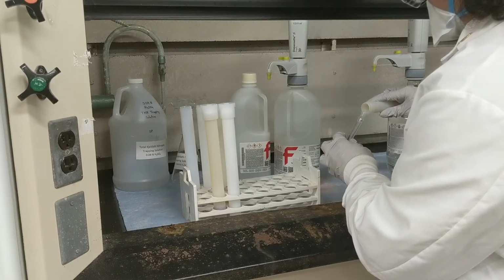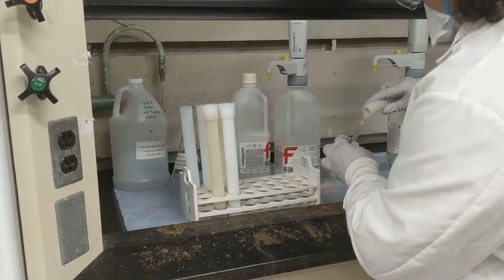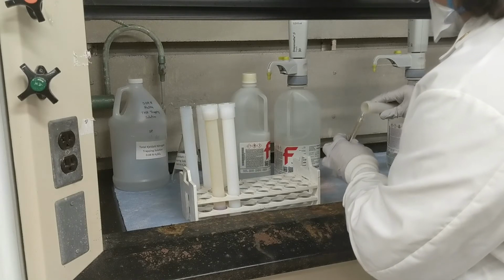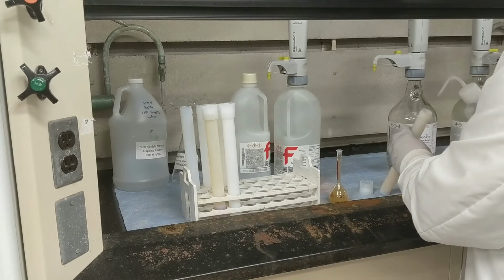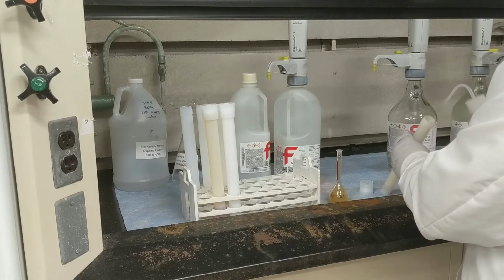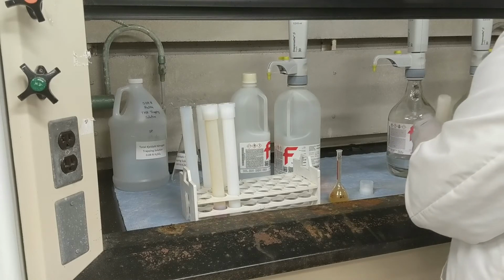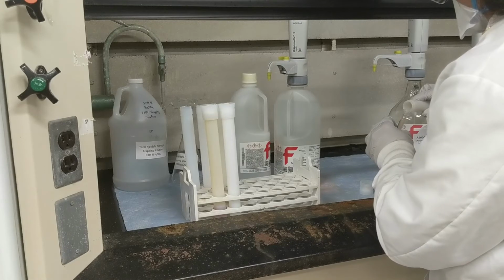For a 50 mil volumetric flask like I'm using here, the necks are pretty thin, so you have to pour pretty slowly, or else you run the risk of spilling. Once you've poured as much as you can into the vessel, we want to rinse the inside walls of the vessel and do it again at least twice, maybe three times, just making sure that you don't go over the total volume of the volumetric flask that you're pouring into.